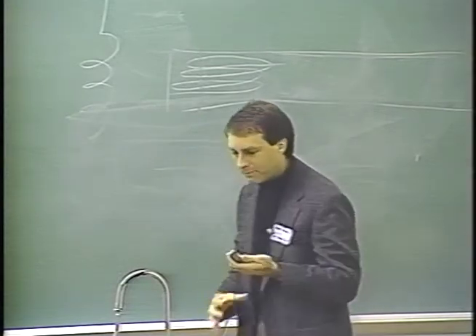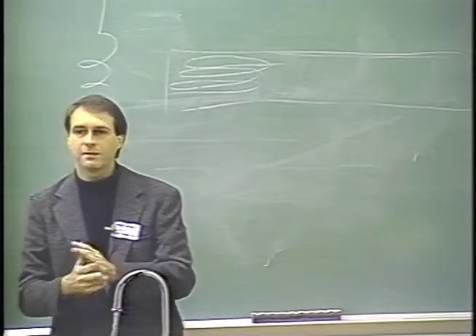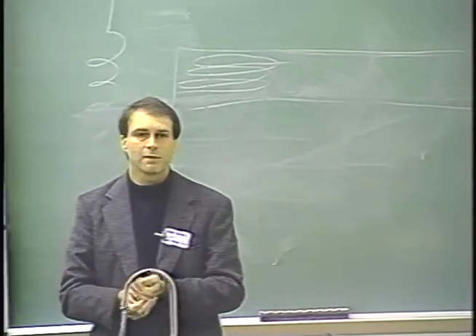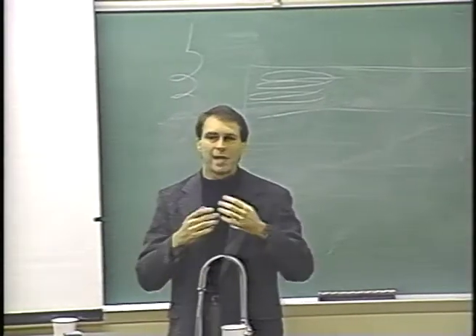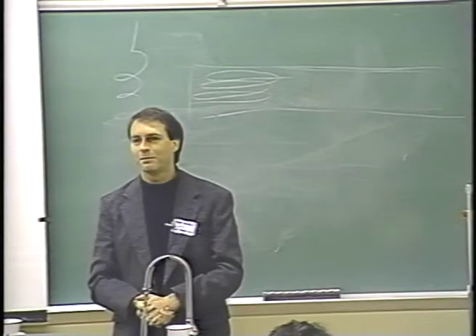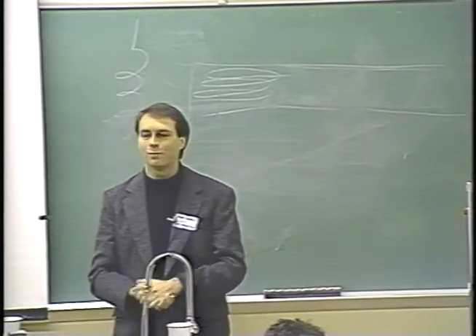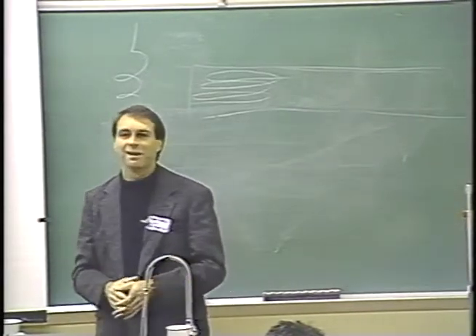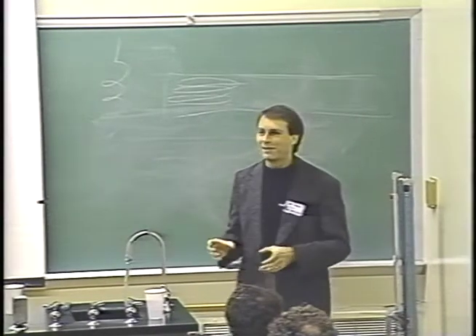And so I'll end with that and just give you an idea that the technology for this kind of tomographic reconstruction, whether it be of chromosomes, which is what we're doing, or any other aspect of things in the cells, is available. We've in fact even collaborated with other people on doing materials science reconstructions of multi-phasic plastics that are used in things like Ferrari car bodies, as a way of determining domain structure in those.